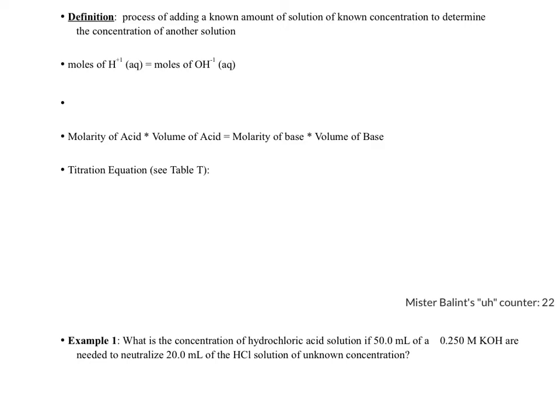Essentially, if you forget what concentration means, it has to do with when we did the Kool-Aid lab. More concentrated things or less concentrated things, we can use this process called titration to figure out how concentrated something is. Let me show you, because we can do this mathematically.